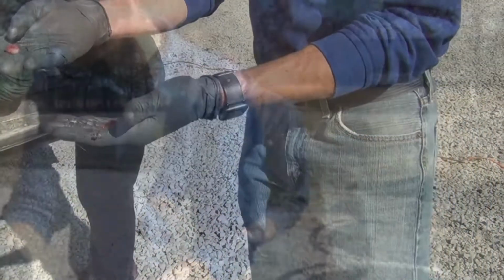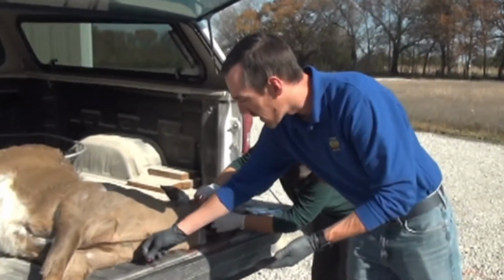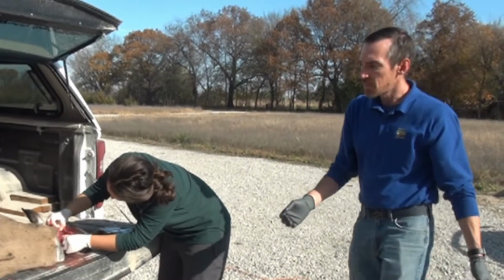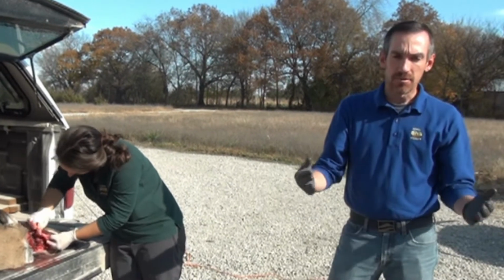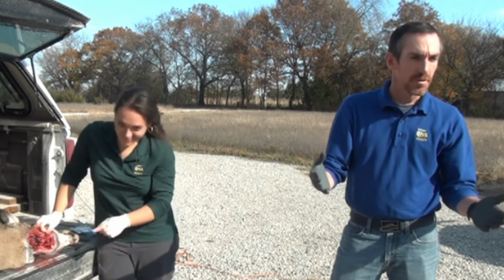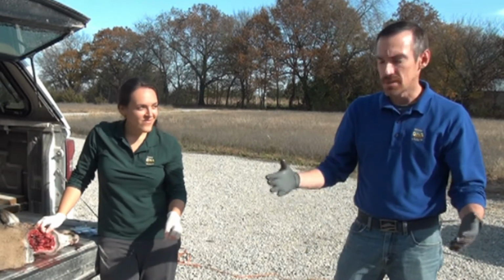So this is one of the lymph nodes here. We sample two lymph nodes, one on either side of the neck, as Dr. Rudin mentioned. Essentially, we really only need one of the lymph nodes for sampling, but we always like to have a backup. You never know what might happen at the lab. Sometimes they're not able to get enough tissue out of one lymph node for the testing process, and so it's nice to have that backup just in case.